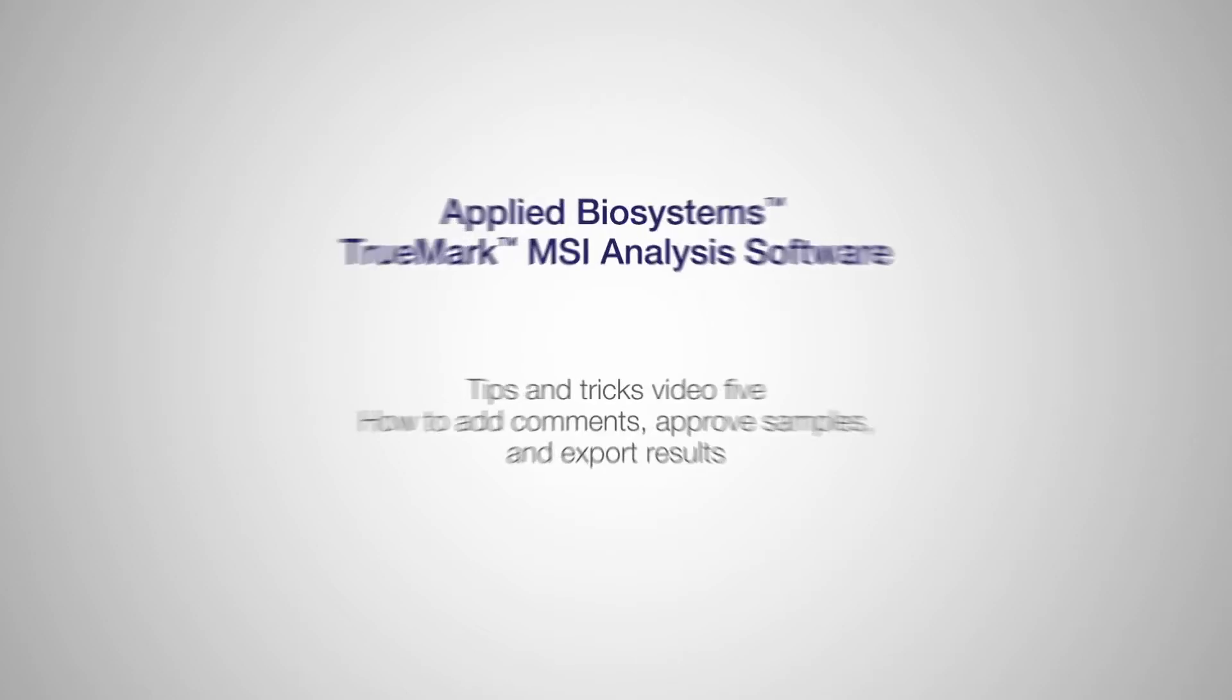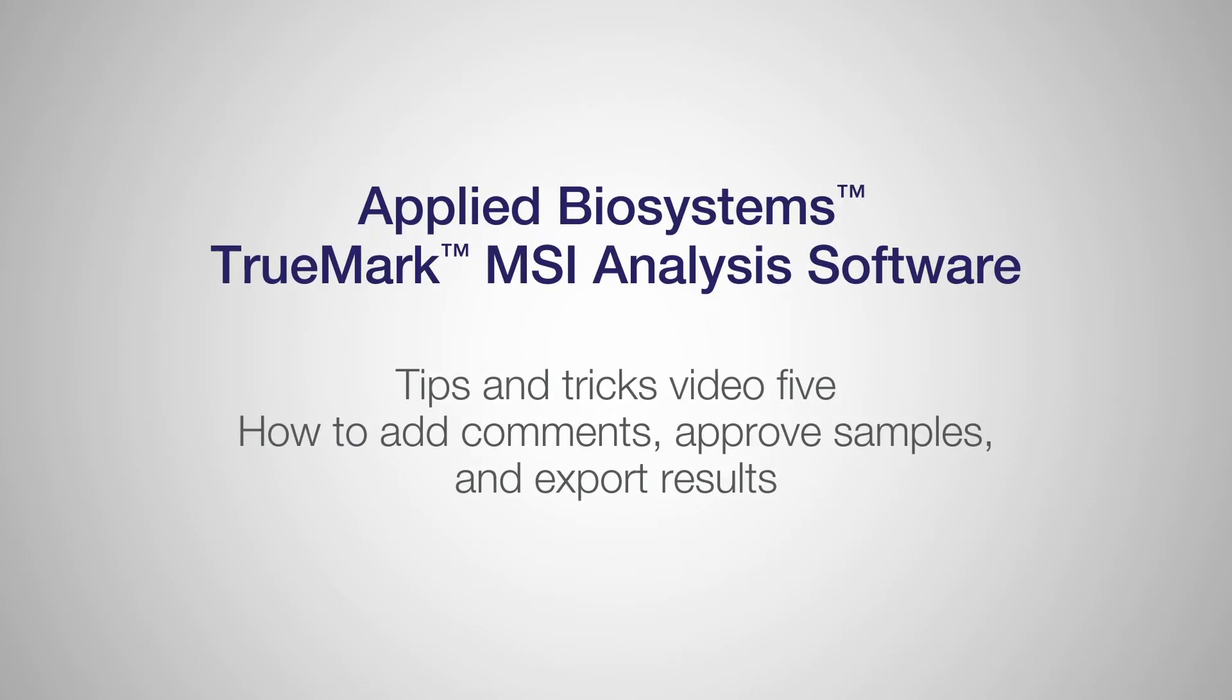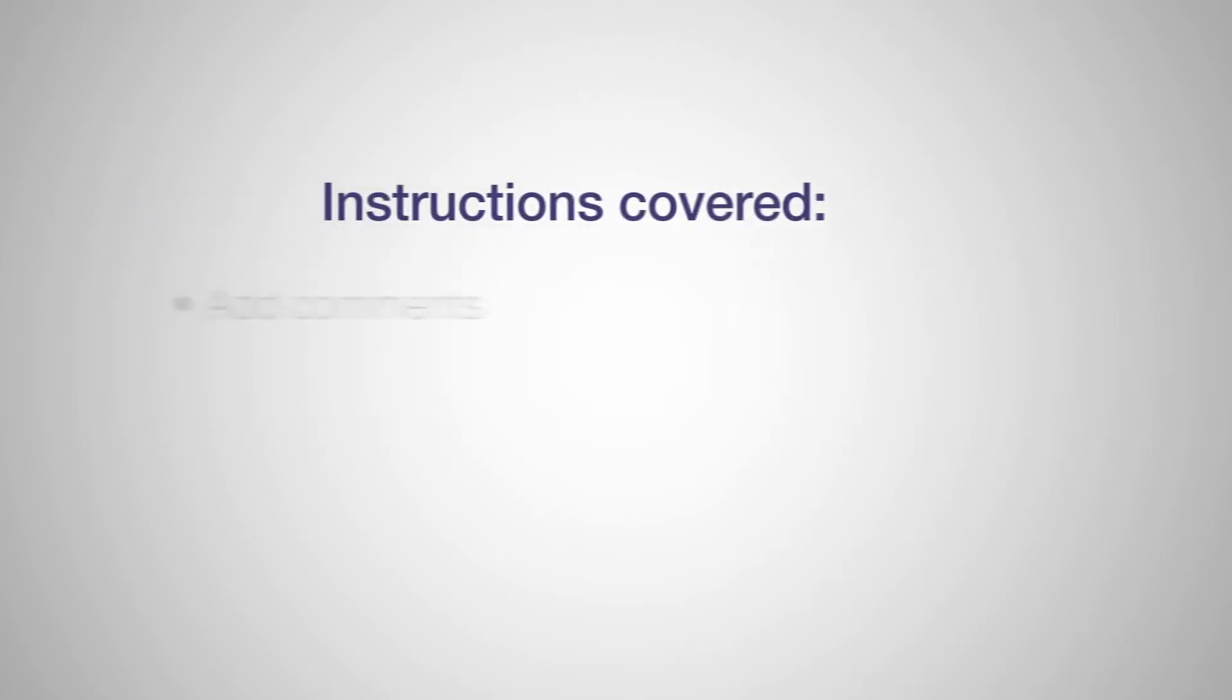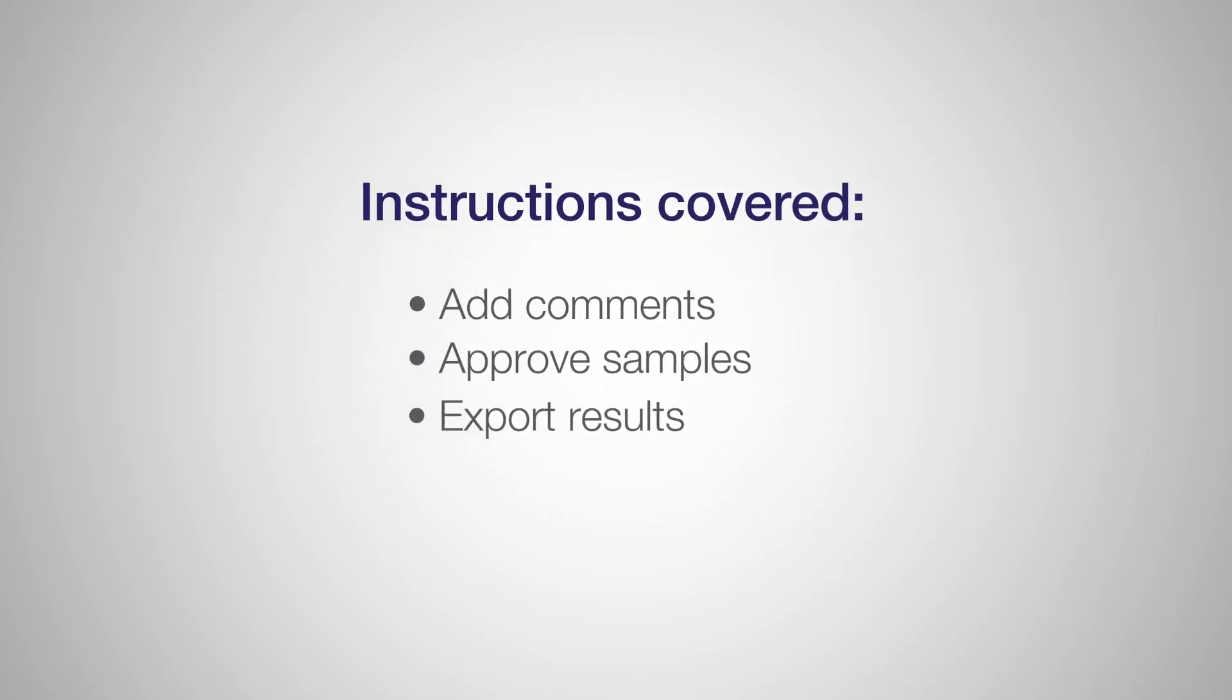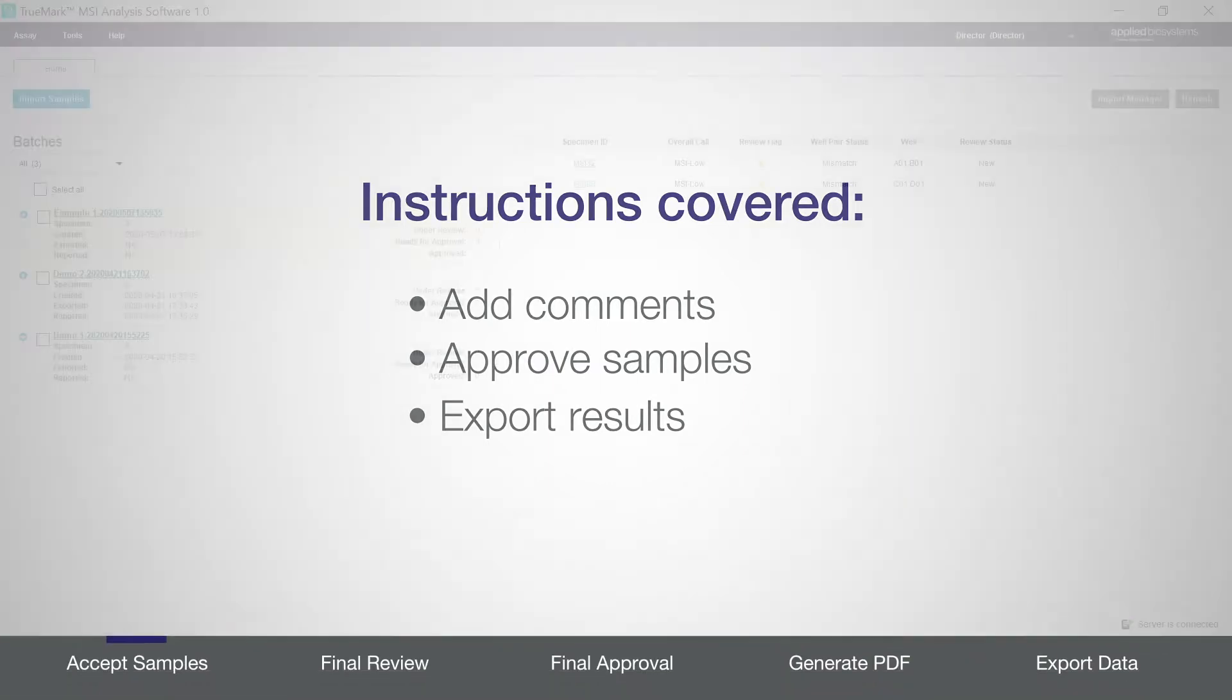Welcome to the fifth in our series of tips and tricks videos for the Applied Biosystems TrueMark MSI analysis software. In this short video we'll cover how to add comments, approve samples, and export results.